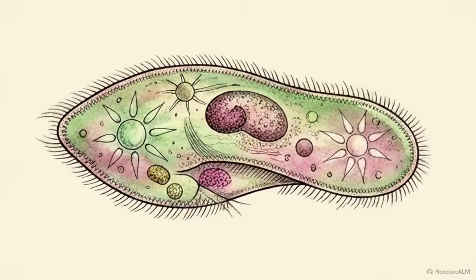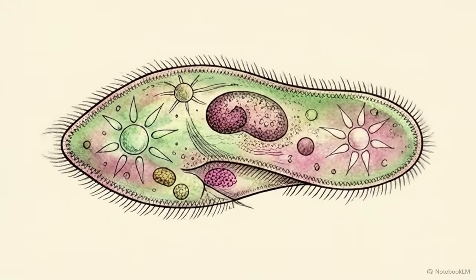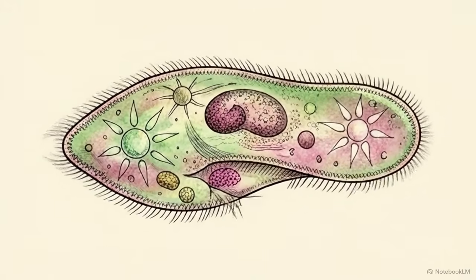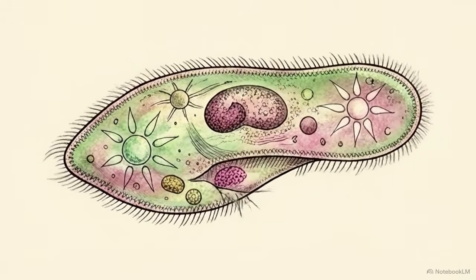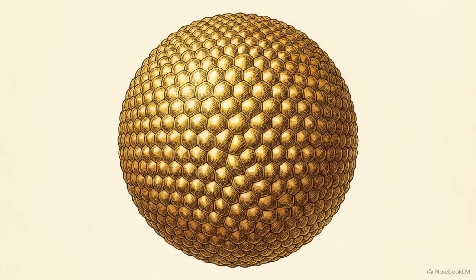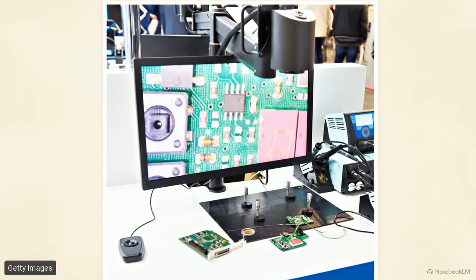Modern microscopy requires a calculated trade-off. You can use light to watch a living organism swim and hunt, but you sacrifice ultimate detail. Or you can use electrons to achieve absolute resolution, but the harsh vacuum and metal coating required will kill the living specimen. Today, we continue to push these tools further.